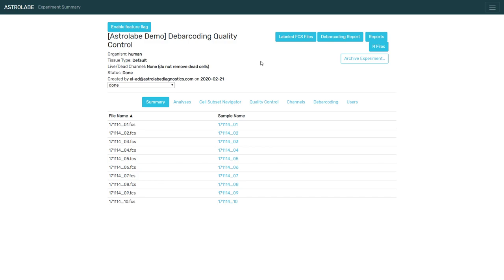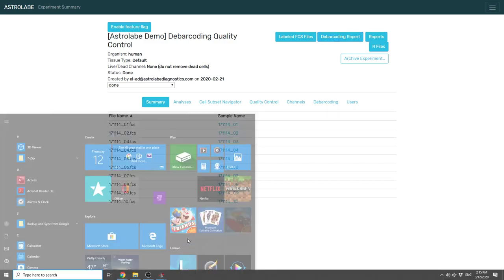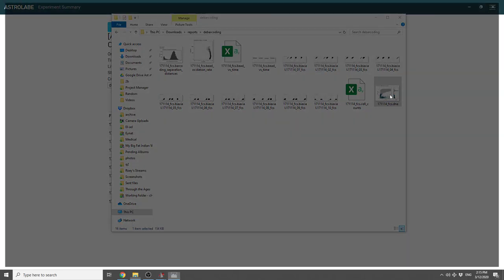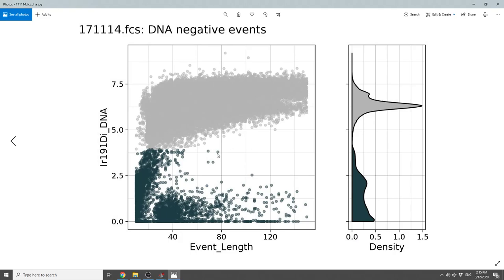Then, once debarcoding is done, you can download this debarcoding report. And it includes many different figures that you can use to assess the quality of the data. First of all, it's going to show you if any cells are negative for DNA, and these are removed prior to debarcoding.